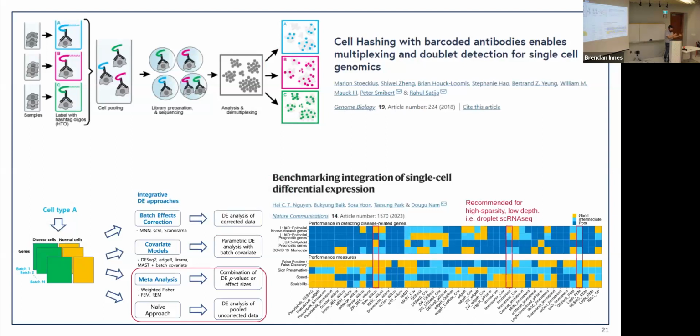One of them, in advance, is this concept of cell hashing, which is not a new concept, but it's not that popular because it's hard and it's probably expensive, I don't know. It's this idea that you use the CITE-seq method of barcoded antibodies to label cells in some way, and you just label cells with which sample they came from so that you can pool them all together and still get barcoded, this cell came from this sample in your analysis.